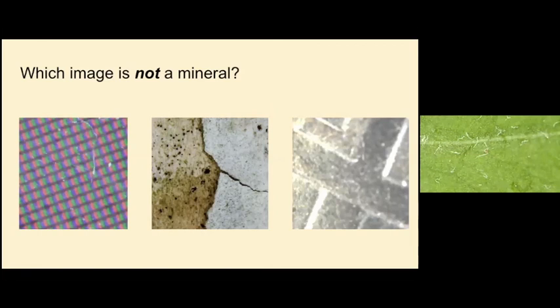That can't be wood. Can't be wood? Since it has white. How can there be white? That's a really good question. And it brings us back to that color. Can we think of maybe any trees that we see out and about that look white?